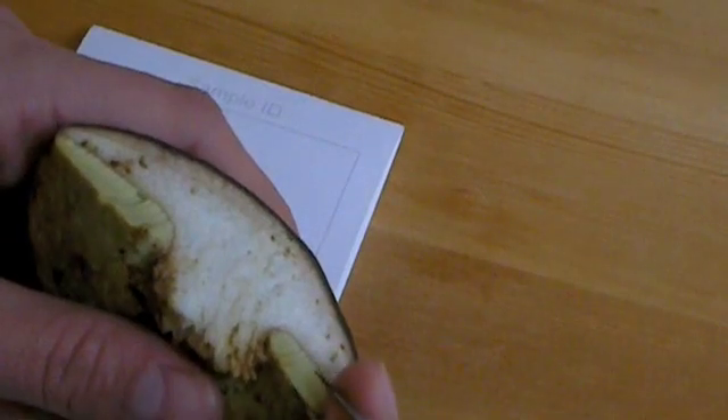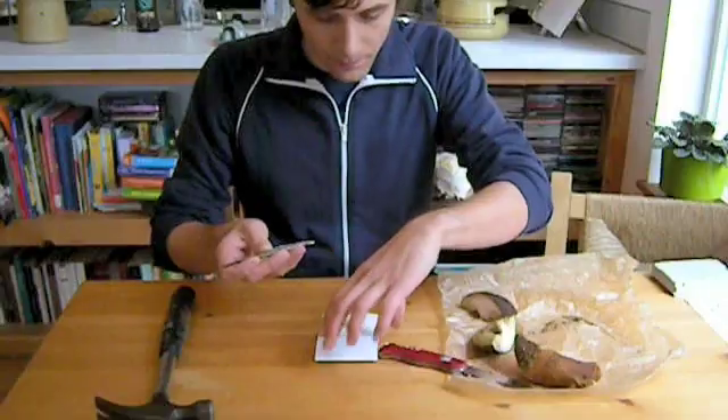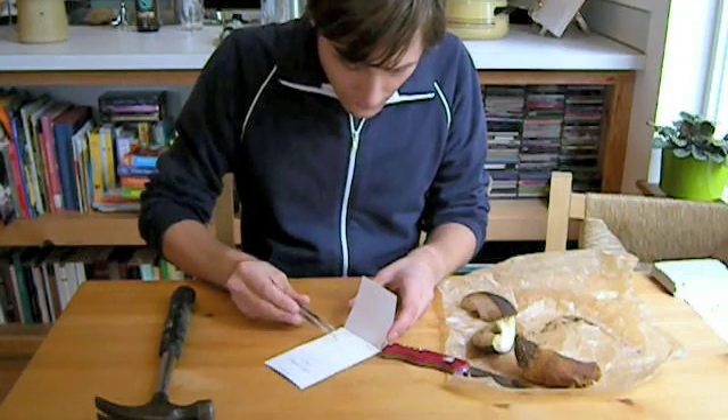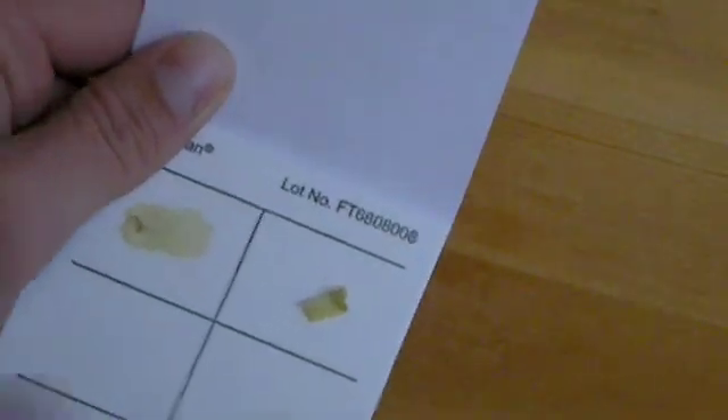Take a clean fresh piece of reproductive tissue — here I tore off some tubes of ebolete — and place that tissue in the middle of one of the sample areas. You want to be careful when you place the tissue in the sample area so you don't damage the surface of the card.